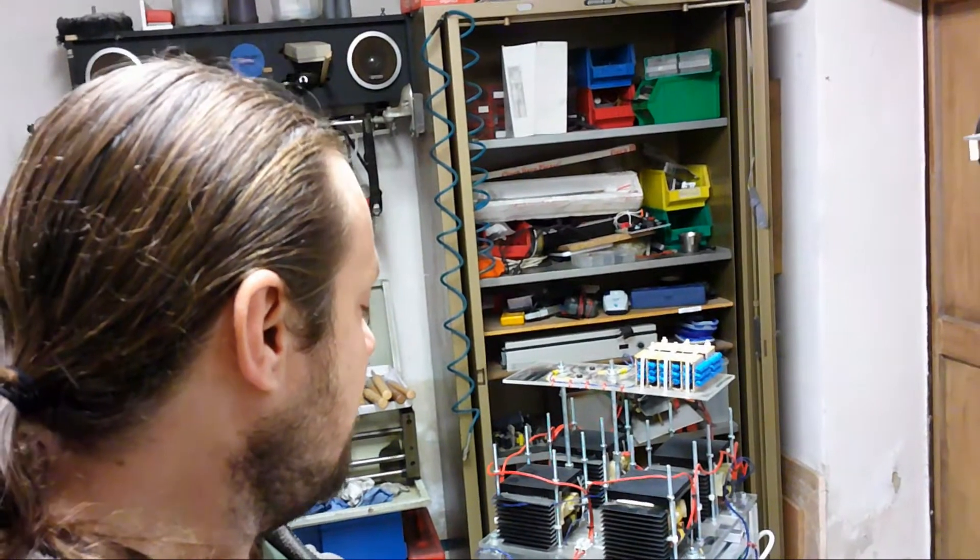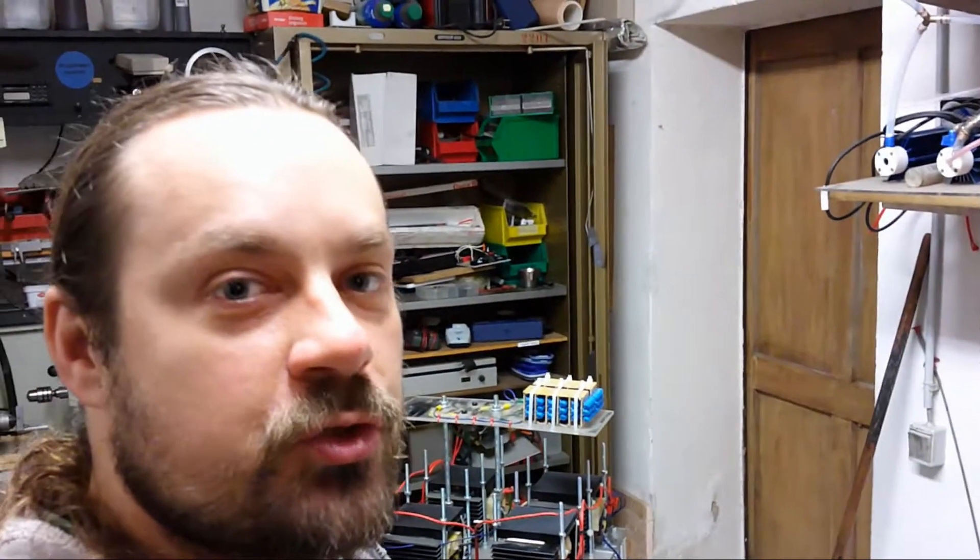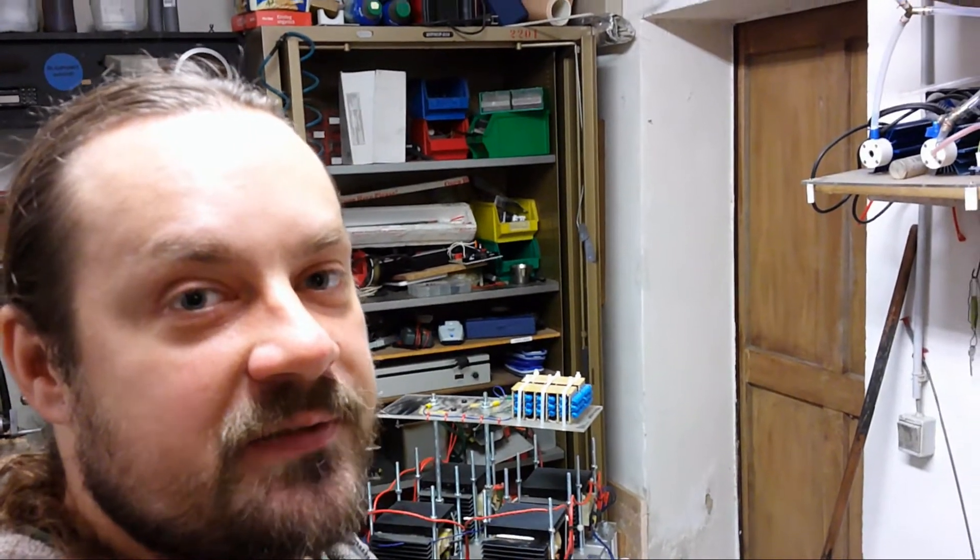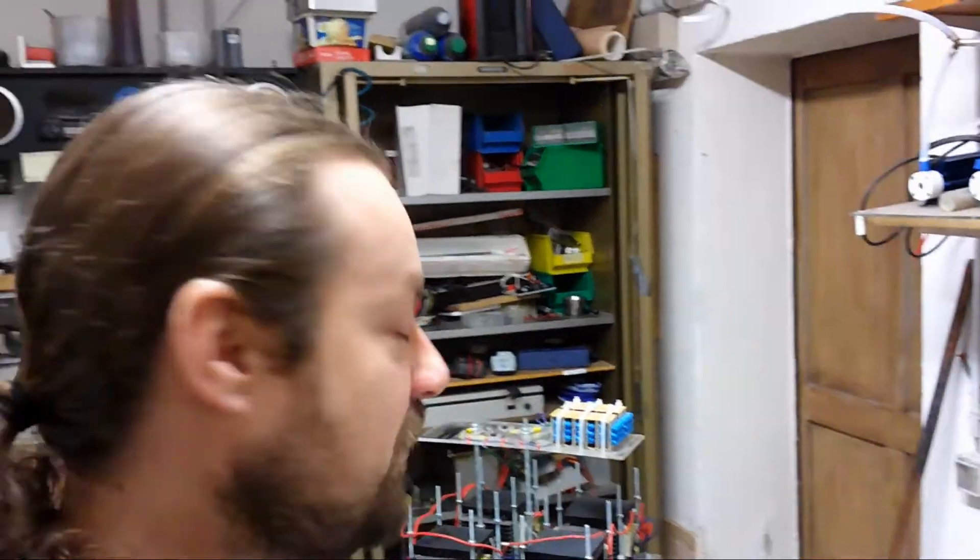My plan is to share all the plans with you, the building plans and to tell you everything about it, how to build such a thing. So let's have a closer look.